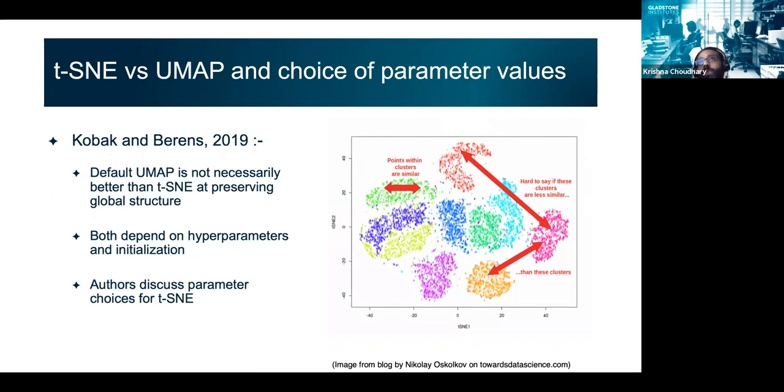We can have the cells located according to their coordinates in the top two PC space, and that can be fed to the t-SNE or UMAP algorithms. That can lead to better preservation of the global structure, because the global structure will trickle through iterations of optimization and be preserved in some way in the final embedding that we end up with.